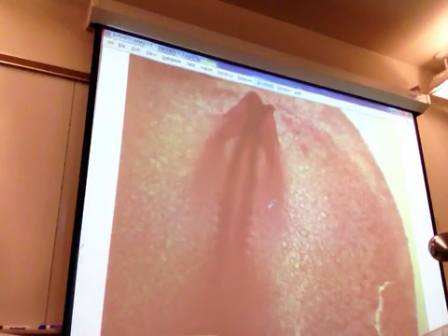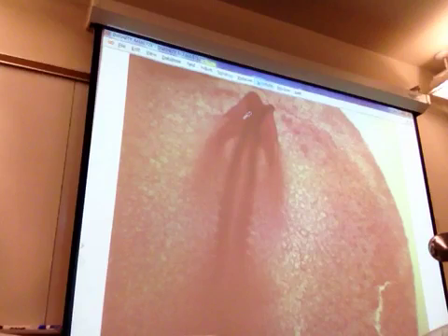So, if you want, let me see. I've got a chick. What's the thing forming in the middle again? What cord? That's the notochord. There's the notochord. This is actually the neural groove, because see, the groove is open. That's what you've got labeled on your first 12 weeks of development in figure 29.7, and they show you an EM, and it's showing you the axis of the future spinal cord. That is the neural groove.